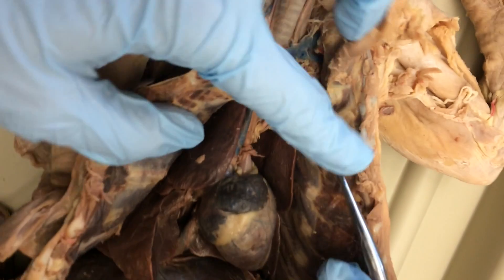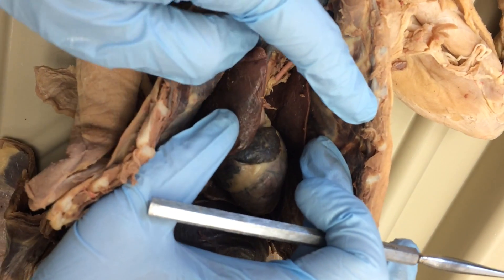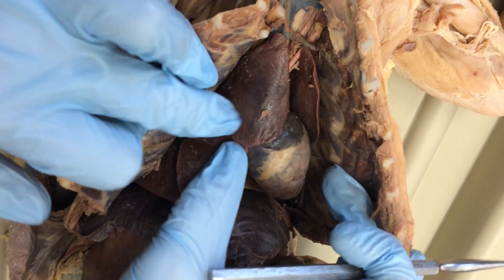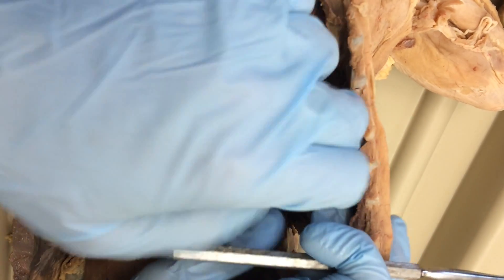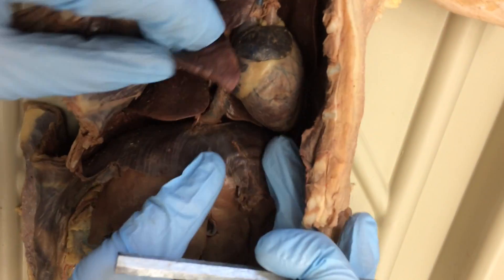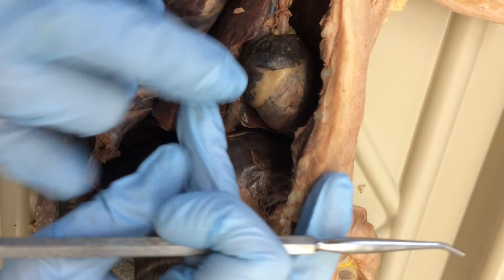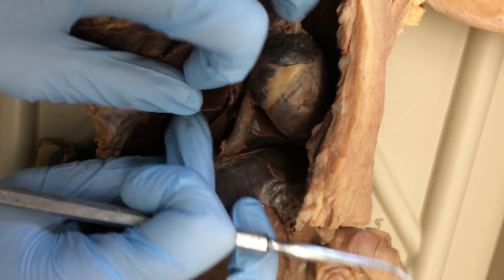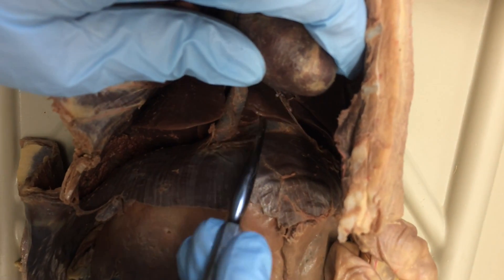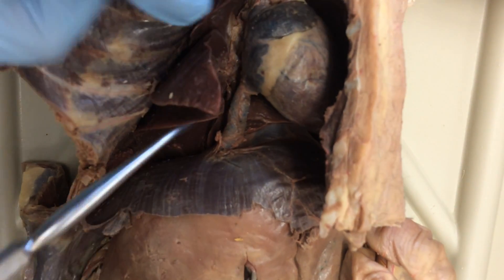There are three paired lung lobes and one unpaired one. Lung lobes are easy: anterior right and left, middle right and left, and then posterior right and left. And then this one little guy in the middle — that's the accessory lobe. It's the only unpaired one.